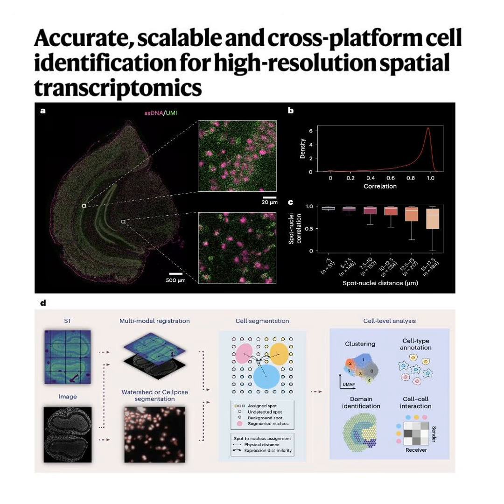Right. It prioritizes expression recovery over exact morphological boundaries. Exactly. If the RNA has diffused widely, Cellist will theoretically assign it to the right cell and recover the molecular profile, but it won't draw the perfect physical shape of the original cell membrane. It's prioritizing the ingredients over the exact shape of the pizza bomb. Yes, perfect callback. It also applies its probabilistic rules globally. It cannot yet dynamically adjust its hyperparameter, that alpha slider, based on the specific cell type it is looking at. Like a macrophage and a fibroblast might diffuse differently, but Cellist treats them the same mechanically.